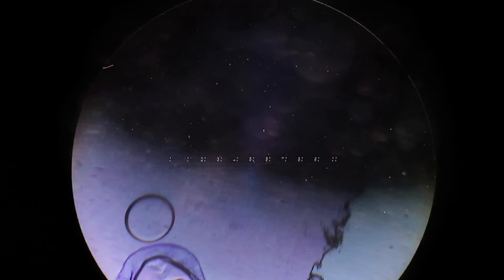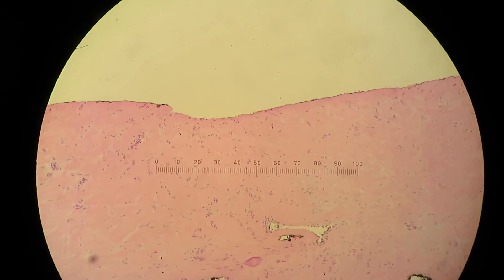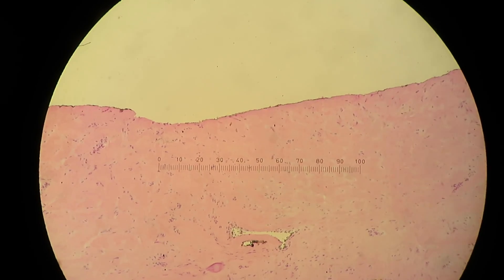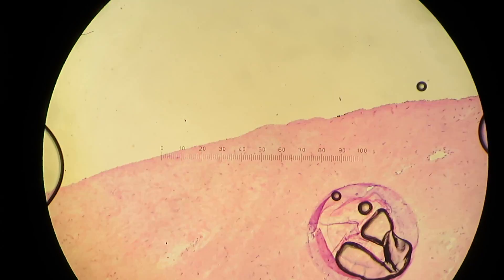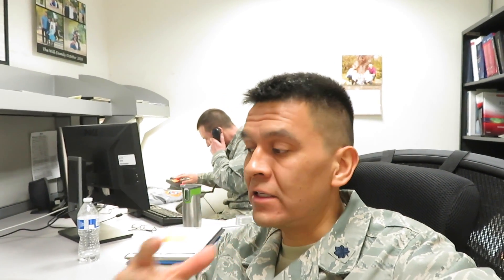It has slit-like vascular spaces and dense fibrous stroma, so I think that's what we've got. There's pink fibrous stroma and a vessel in the middle there. Now that we've looked at it and feel comfortable, we call the surgeon in the OR. In this case, we just see benign fibrosis, inflammation, and some vessels — no giant cells or spindle cells. It's good for the patient.